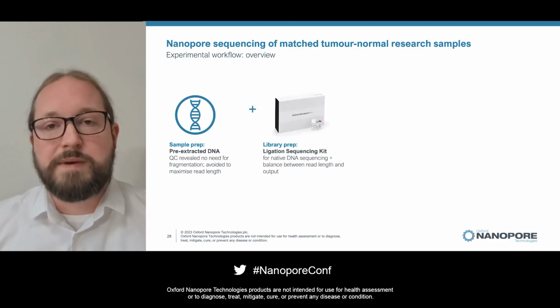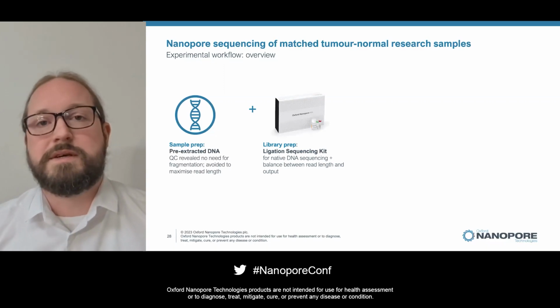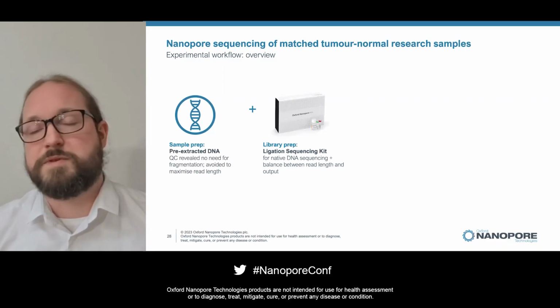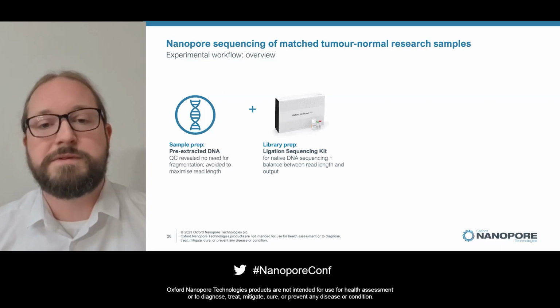Then moving on to the library prep, again, the decision there is pretty easy. The ligation sequencing kit is the clear choice here, and this is what we did. As a reminder, it's a good balance between read length and output, and usability and ease of use.